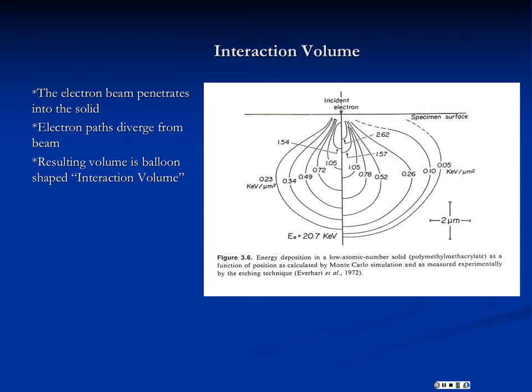All right, so as we think about that beam we're aiming at the surface, we need to recognize that electrons are little bitty things, and a surface of a solid is still mostly empty space. There isn't much there. So when an electron hits the surface, some electrons may bounce back, but most electrons penetrate into the surface.